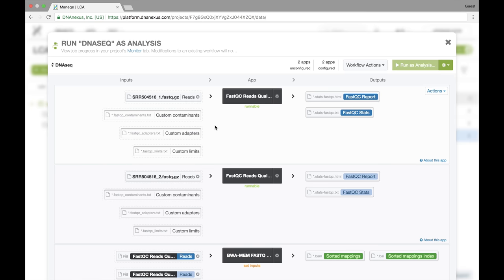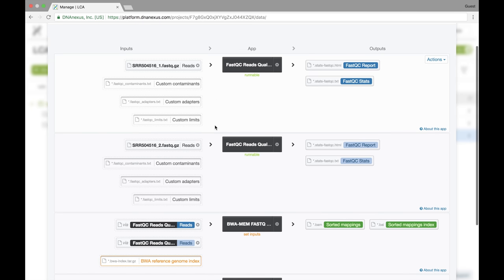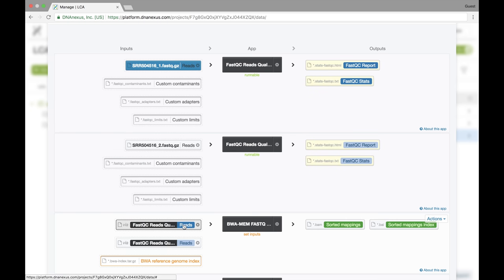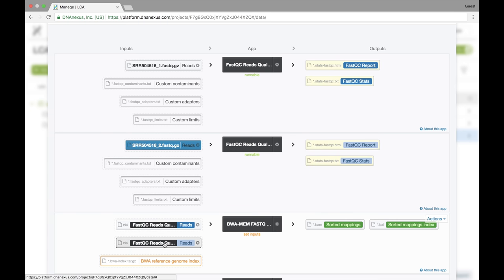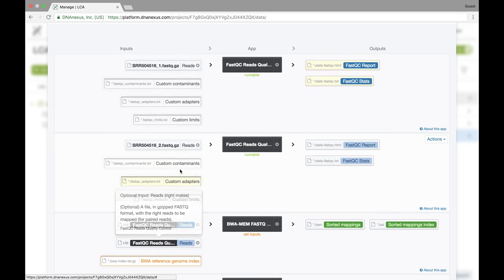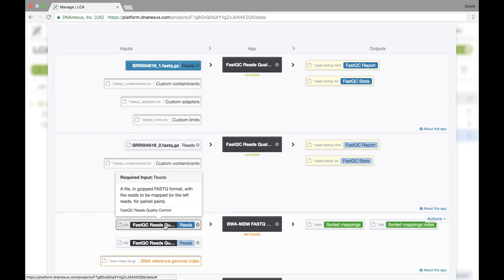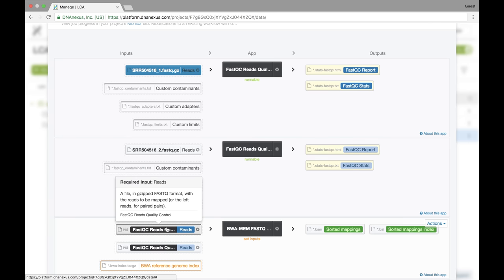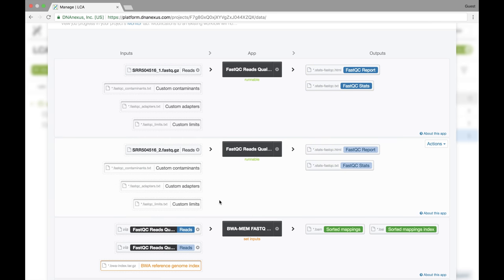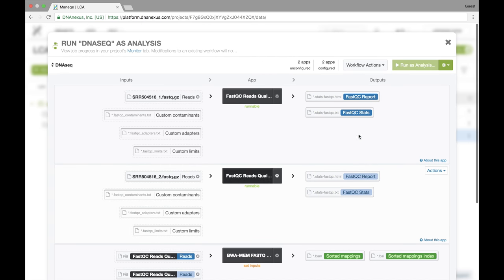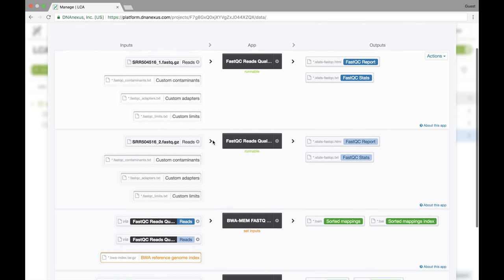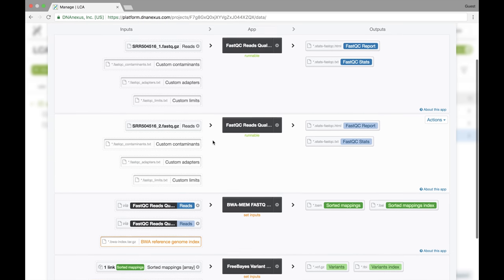And I want to point out really quickly that I don't need to set the forward and reverse read for BWA-MEM because we've automatically mapped the input of FastQC to the input of BWA-MEM. So we set up forward and reverse reads. However, you can see that our workflow still can't be run quite yet.